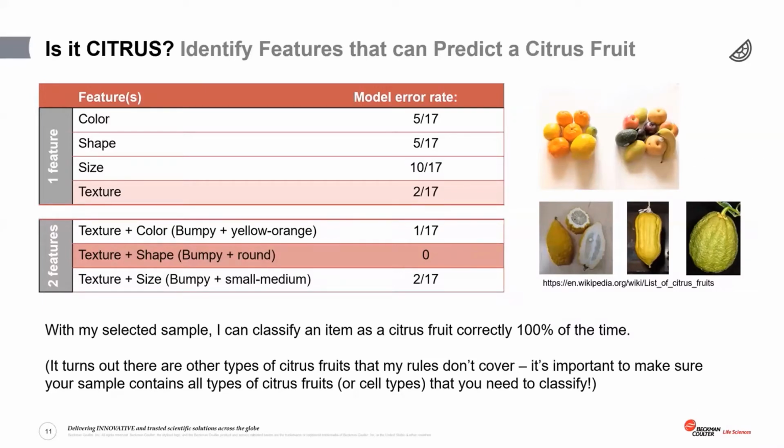Fortunately, the predictive modeling algorithms in the citrus tool have ways to deal with this by favoring simpler, more broadly applicable models. So here, with my fruit classification problem, we use a simple mental algorithm to identify these simple features for a small sample. For our more complex, higher dimensional data, we'll now turn to citrus to solve these classification problems.